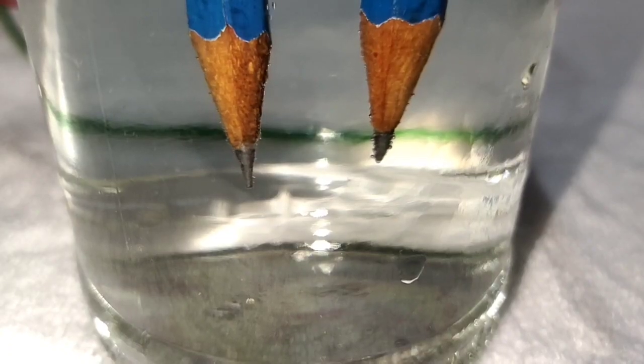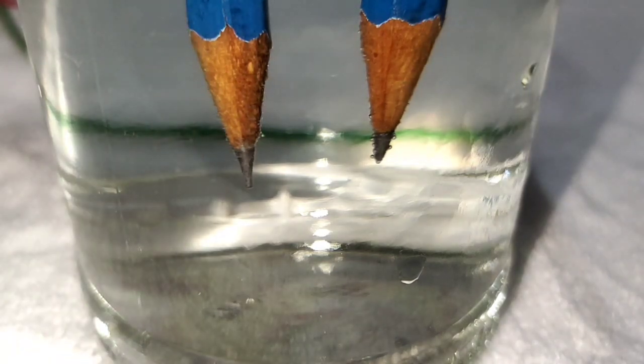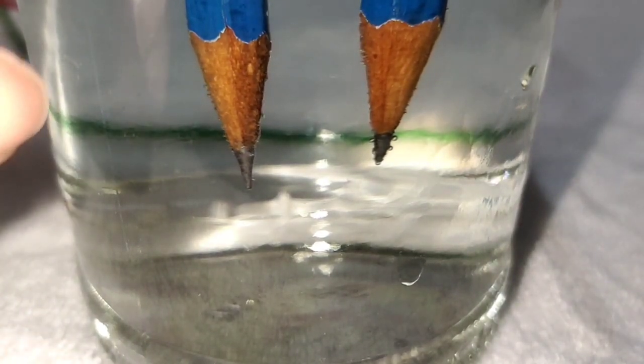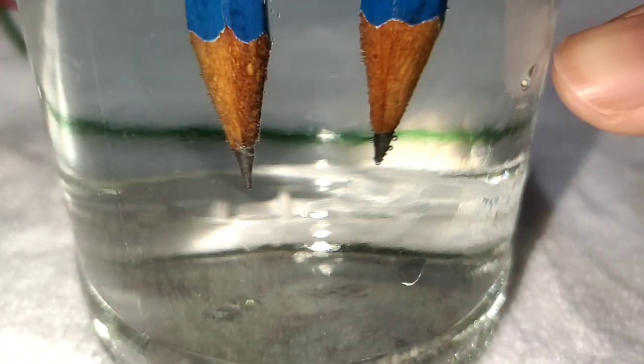After adding salt and observing for 5 more minutes, we notice that air bubbles appear at both electrodes, and the hydrogen gas appears to be more than the oxygen gas at the anode. So this is our hydrogen gas and this is our oxygen gas. So this is the cathode and the other side here is the anode.